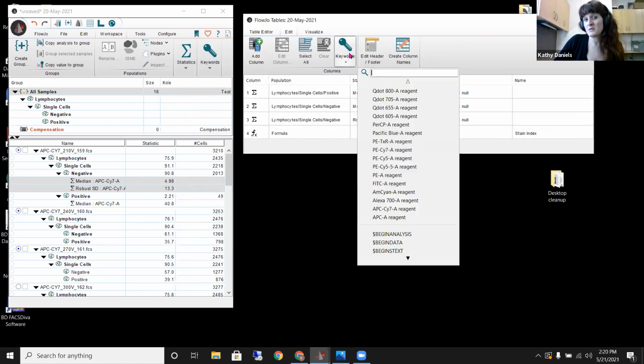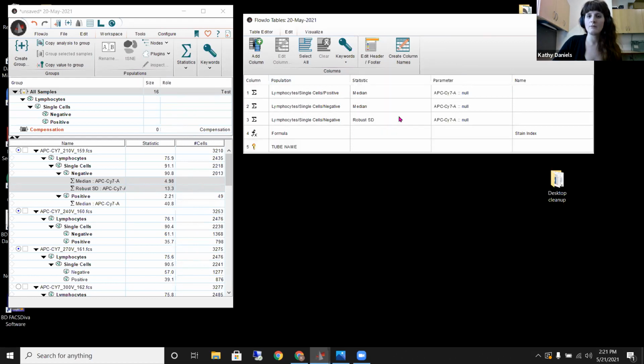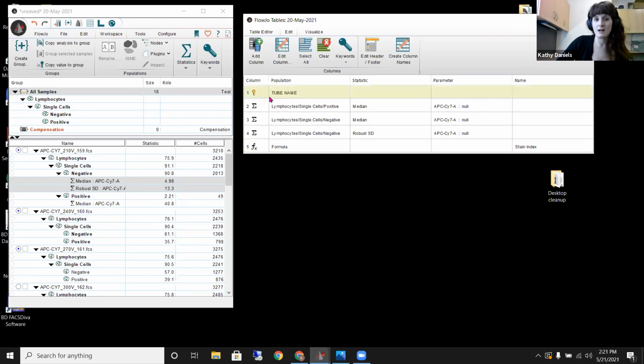The other nice thing we can do is we can add keywords. So if you want to say, I want that tube name in there, all I have to do is start typing in the starting name of that keyword. And there it is. We have the tube name that'll come in for the table that we create. I probably don't need that, but I'll leave it in, and I can always drag it up to the top and change the order if I want.